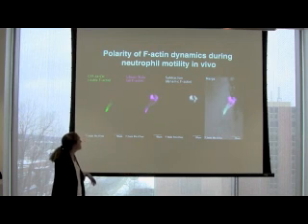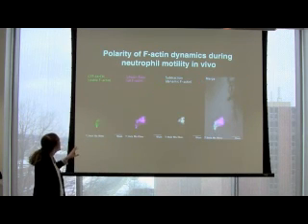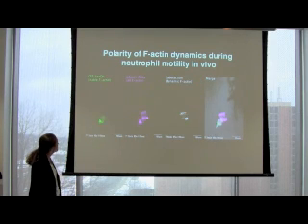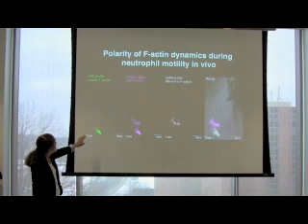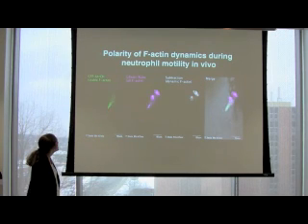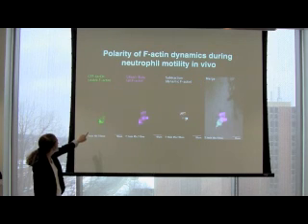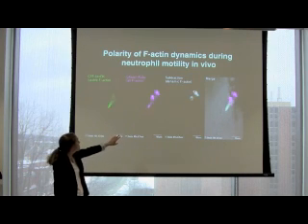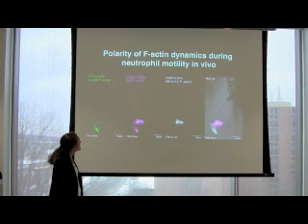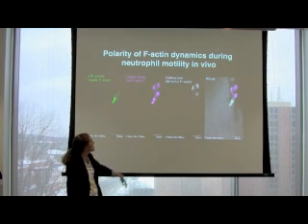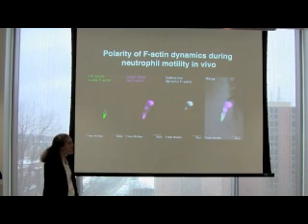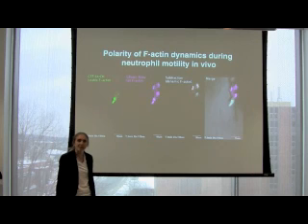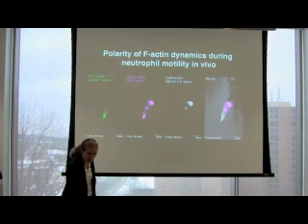One of the first images I'd like to show is our ability to finely look at the polarity of cell signaling as neutrophils are migrating in vivo. We've used two probes: one for stable F-actin using the eutrophin probe fused to GFP, which labels actin at the rear of the neutrophil as it migrates in vivo. We also use LIFACT-Ruby, which labels both dynamic and stable F-actin, and we can subtract this image to look at dynamic F-actin at the leading edge. This shows the temporal and spatial dynamics of F-actin as neutrophils migrate in vivo.